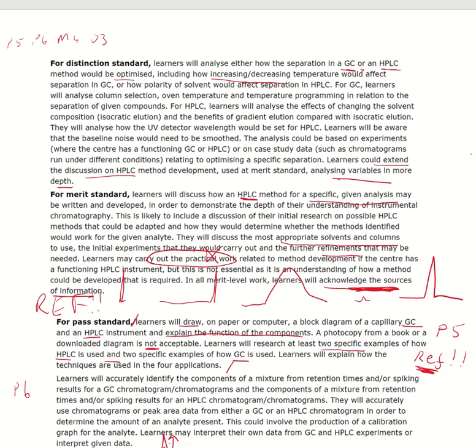For HPLC, the polarity, how would that affect it? So again, with all of these, we're going to be looking at column selection, temperatures that I've just mentioned there, the programming, so what I was talking about, how fast you want it to heat up. For HPLC, you could change the solvent actually during the practical. So what we start off with is pumping through, say, a non-polar solvent that gradually becomes more and more polar.